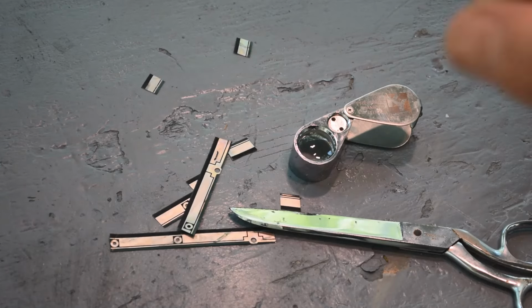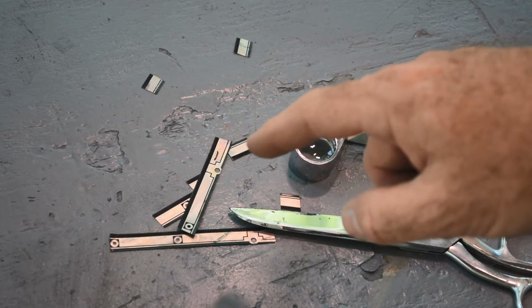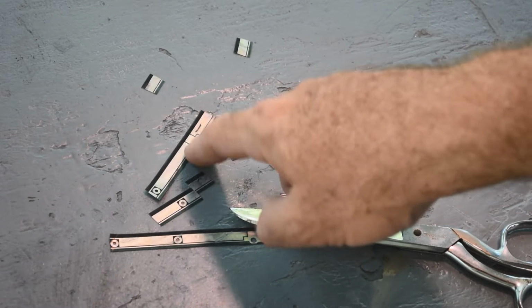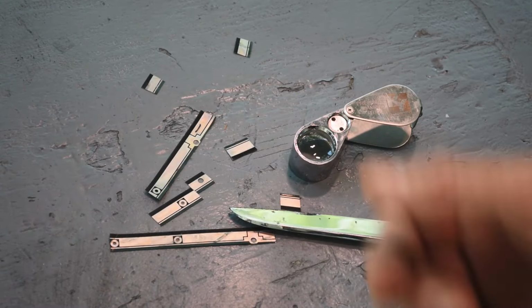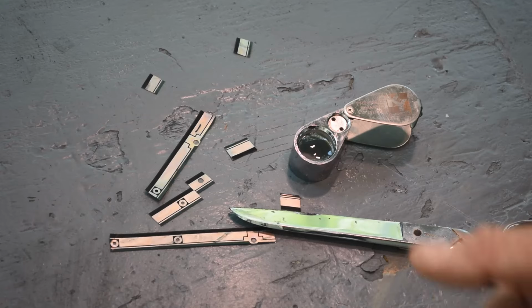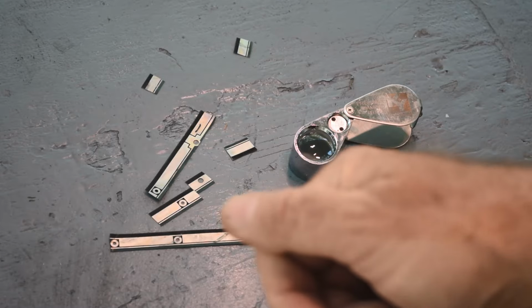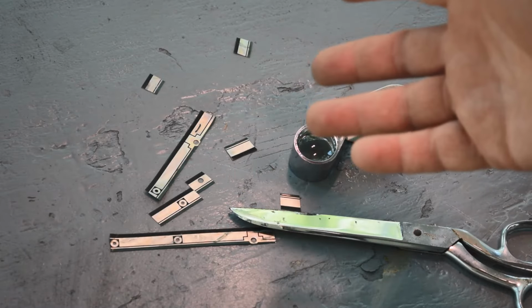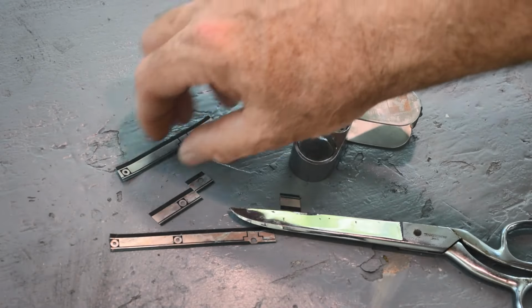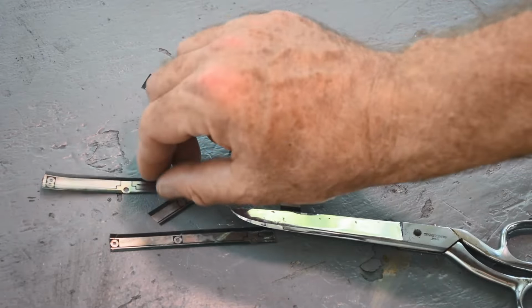Now, a lot of times they'll plate a metal like nickel over copper because copper is a fairly soft metal, nickel's a lot harder. And according to Joven, these were gold plated at one time, and that makes sense. They'd plate gold over the nickel. But he says the gold was removed, and he's thinking there's palladium left. I don't know. I'm thinking anything that would remove the gold would remove the palladium too. But we'll see.